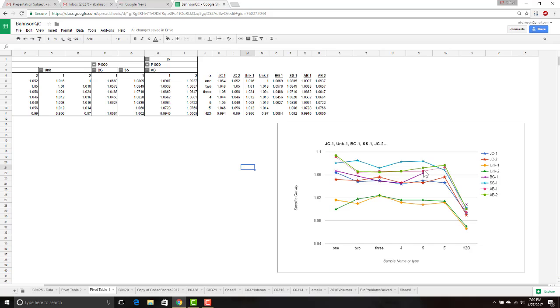But in any case, then for 5, this 5 gallons of stuff was in the big bucket, in the big container, and I mixed up the yeast, the 1 packet, in 100 milliliters of water and added that yeast, and then poured some sample out. That was 5, and then I poured out a duplicate 5 to have 2 samples, just as different from each other as any of these other samples, except they were replicate times and mixtures. This was a well-mixed thing here. And so the yeast didn't have much time to work between 4 and 5, although we got diluted from about 4.8 gallons to 4.81 gallons, not significantly diluted between number 4 here and number 5 with the yeast. And then water is simply a different sample.